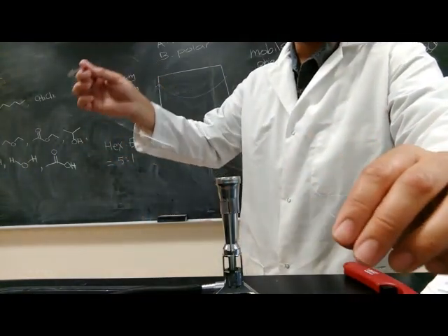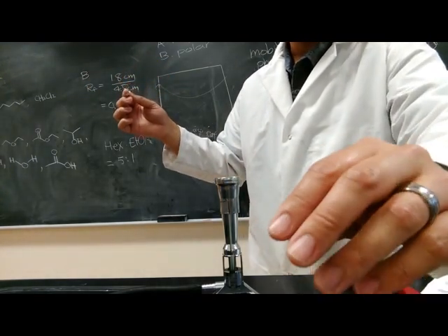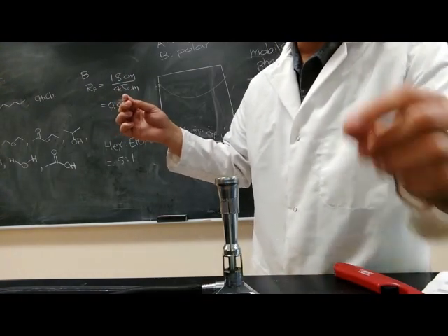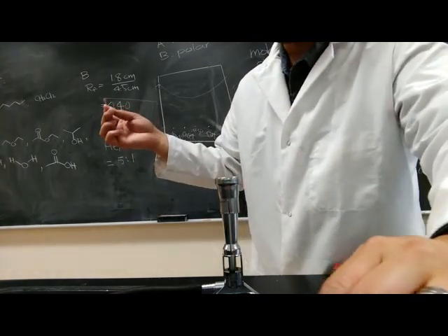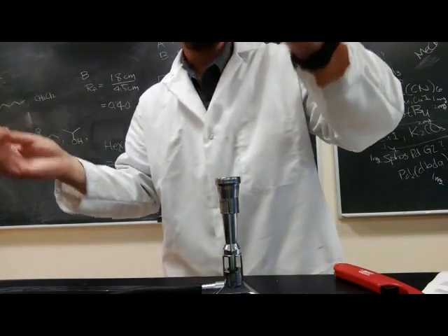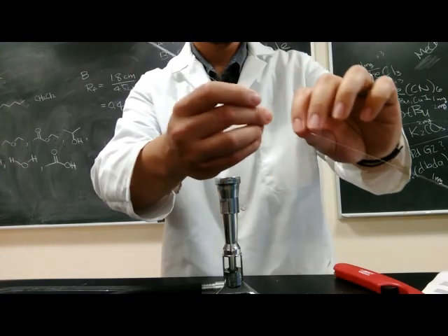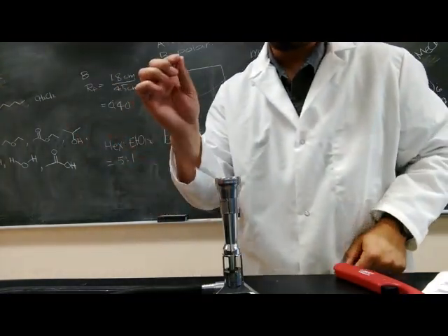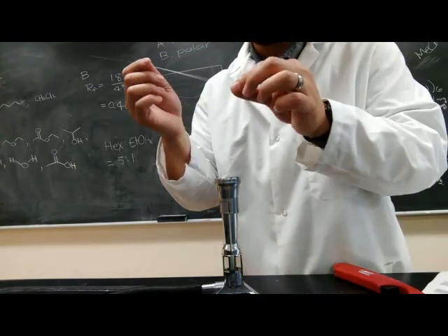Now, I don't know if you can see, we made this really nice capillary. As far as the desired diameter for this, it's really hard to explain on the camera, so you can ask your instructor, I guess like me. But after you make this capillary, it's easy to break it off with your fingers. Now it doesn't need to be this long of a capillary, but I've made enough for quite a bit of experimenting, because these things tend to break.